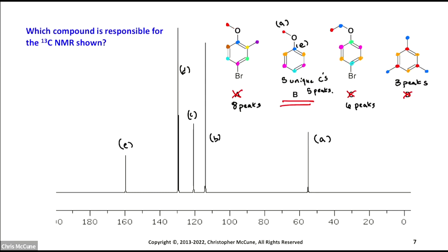And if we look at the other peaks, you can see the ratio of those heights is almost 2 to 1. And so the one that's next to an electron withdrawing group, I believe, is going to be either one of these two, or it could be one of these two, being D or B respectively. So I do know here that this one is going to be C, because you can see the height of the peak relative to B and C is only half.